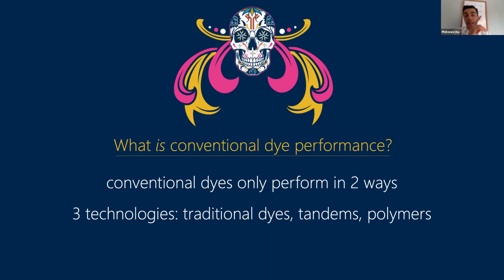Some of the things we will talk about that are new is the ability for us to actually print antibodies. And it's that capability that enabled us to do the 45 colors. I will mention that in this talk. We can do that now both for in-stock antibodies and also for anything that's shipped to us. We've validated that we can actually do it at 1-to-1.